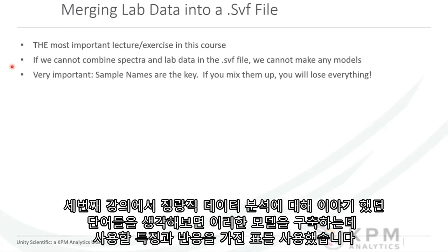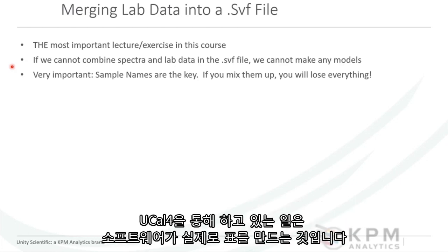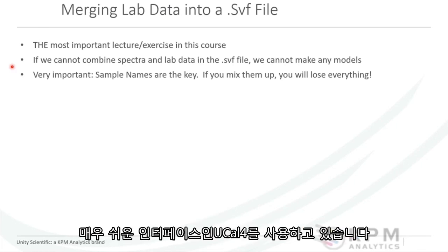If you think about our third lecture, where we talked about quantitative data analytics, we showed a table that had the features and the responses that we will be using to build these models. And what we're doing right now through the UCal4 software is we're actually creating that table. We're just using the UCal4 software as a very easy interface to do it.